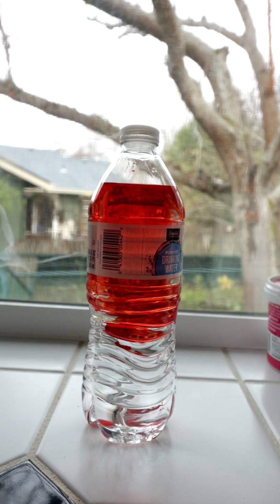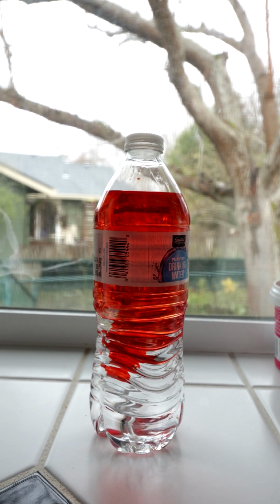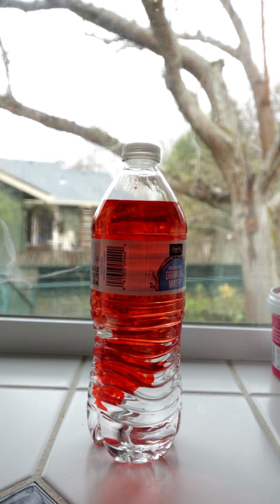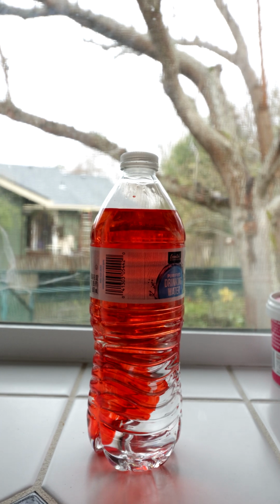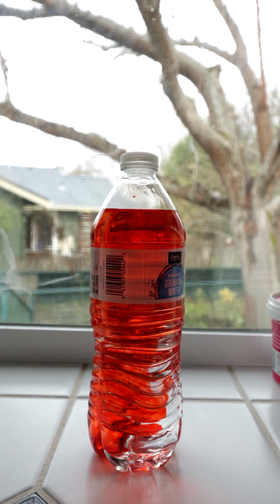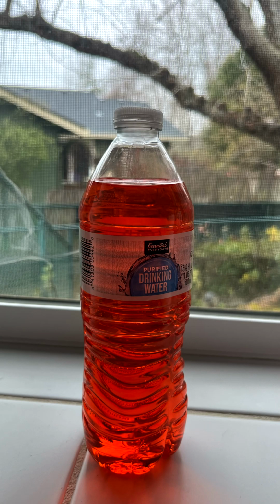In the solution, it was really clear and stable. The food dye was totally dispersed throughout. There was no scattering and no settling. This solution of food dye and water also does not have the Tyndall effect, which we'll talk about more later.